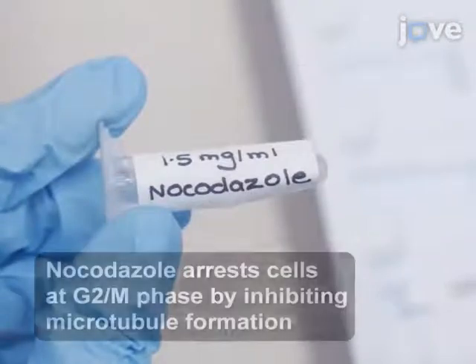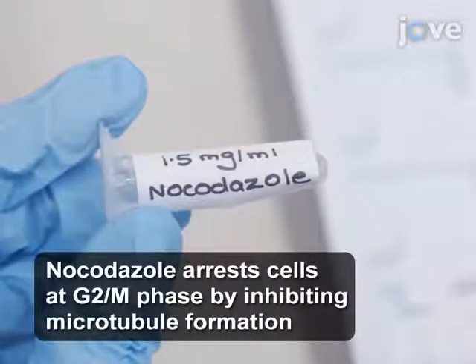On the day of labeling, prepare a 1.5 mg per milliliter stock solution of nocodazole in DMSO. A critical step is to calculate the right amount of CLHV particles per cell to achieve enough labeling for chromosome visualization without toxicity to cells. We had previously determined by titration experiments that 30 ppc works best.